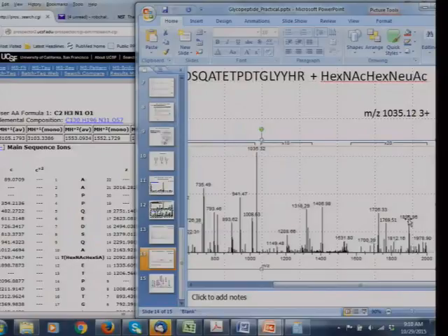So you can see this isn't very easy stuff to do. The software can actually do a lot of this for you. The database search engine, you saw in the examples yesterday, was putting the modification on a specific site. So it is going through and looking for these ions and saying, based on this, I can say that the modification is on this residue and not on another. And so if you use software like Protein Prospector, it's going to give you the site localization information if it's in there.